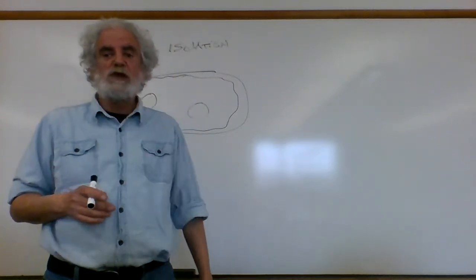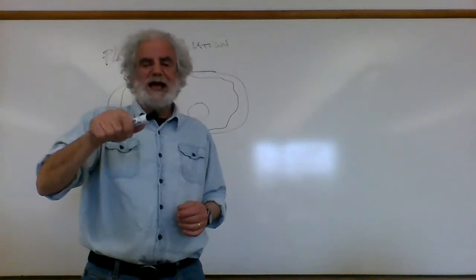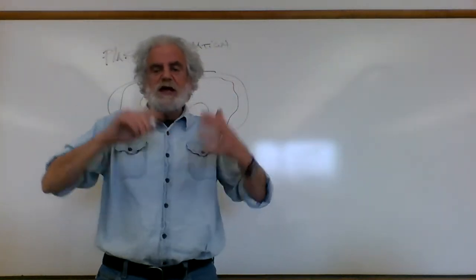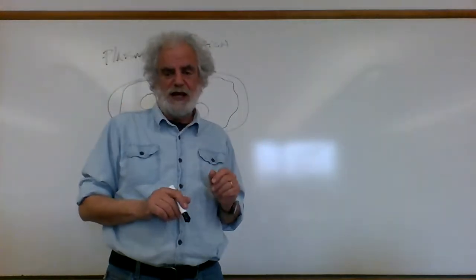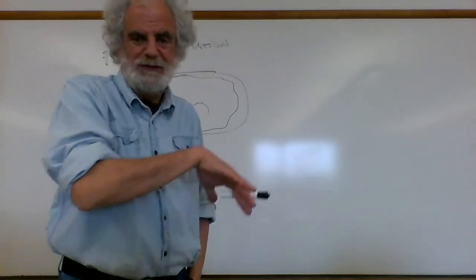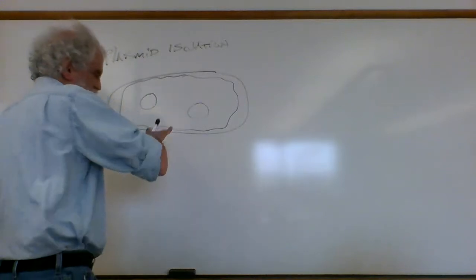And we're going to be working with a specific plasmid today. So next week, we're going to take this plasmid and put it into bacteria. This week, we're going to start out taking bacteria with the plasmid, cracking it open, and extracting the DNA. So it's kind of a circle. All right, in terms of the process, here's the basic principle then.